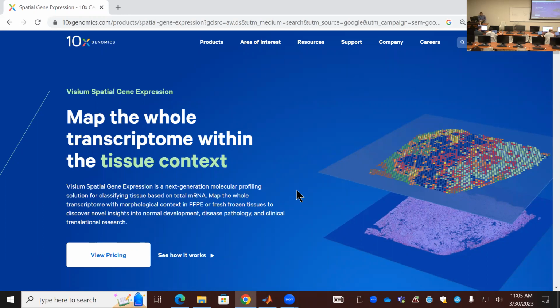So spatial transcriptome is a suite of technology, but we are using the 10x Genomics platform as an example to show you what you can achieve. So you will have a tissue slide section, and then take a picture, and then you have this probe to sample at a different position on this slide to get barcode information for gene expression for all the gene expression in these particular spots. So you have the physical location of each spot, their relationships, then you have this profile. Let's see how this works.